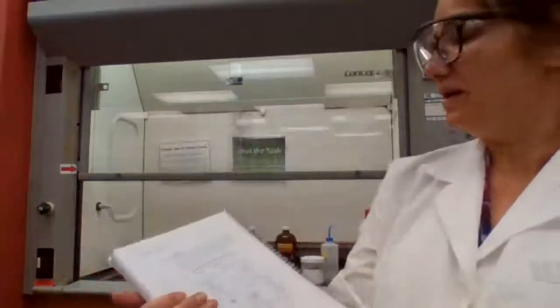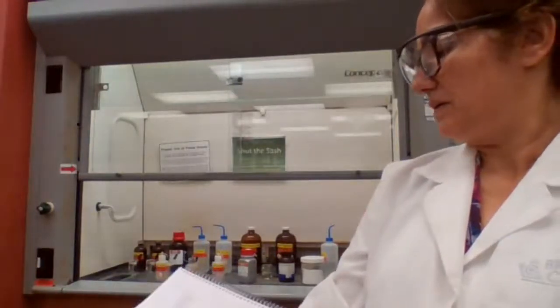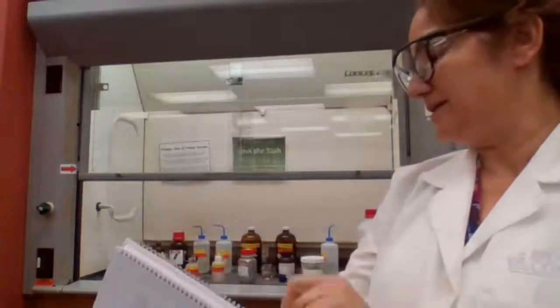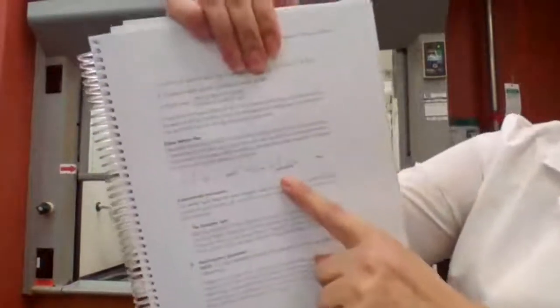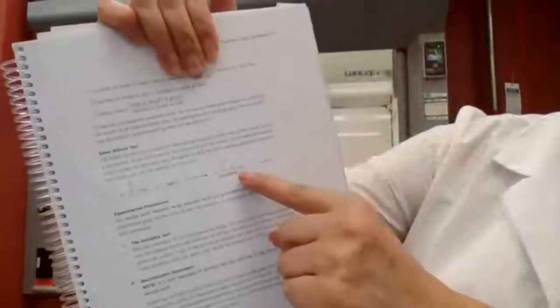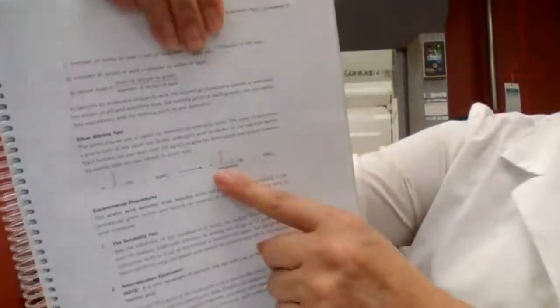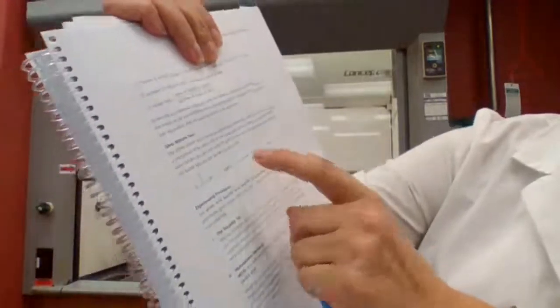So the reaction is between the carboxylic acid and the silver nitrate. We didn't get too much product, but the amount of product that you saw, and if you review the video later, I'm going to post it this afternoon, you could see the flakes, some powder that it formed, and that was the silver carboxylate precipitate. Silver carboxylate precipitate.